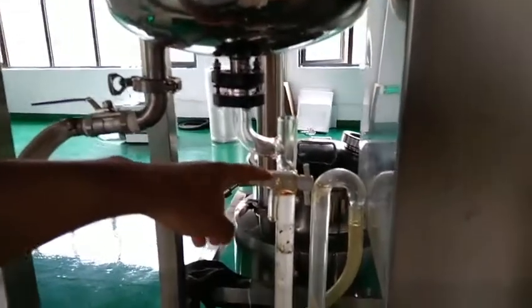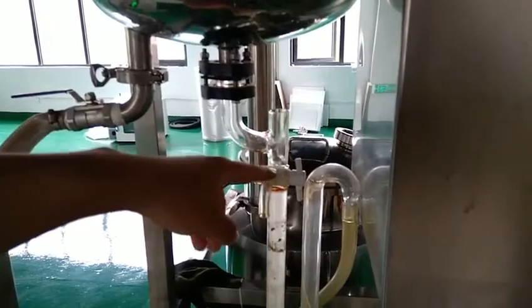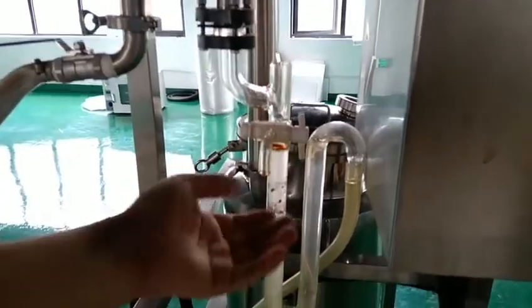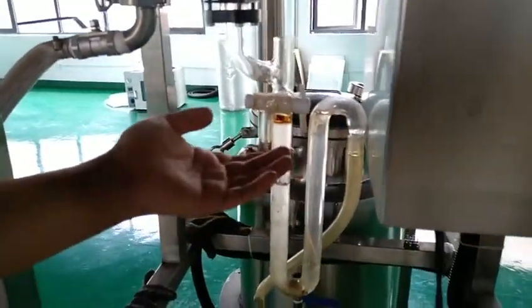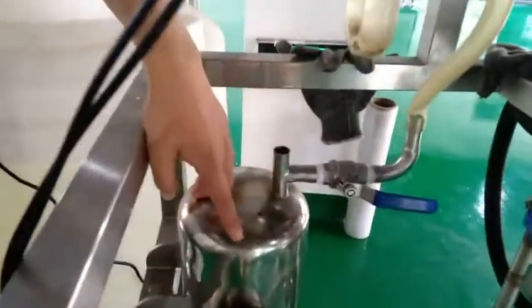This part is the oil water separator. You can open this valve to get the extraction oil from this. This is a dryer tank.